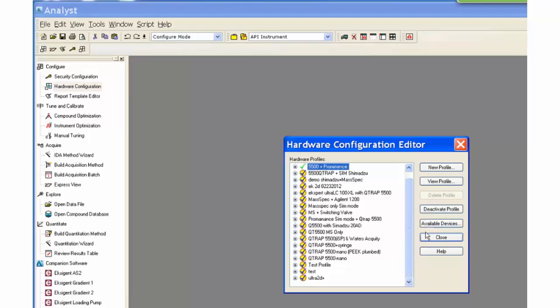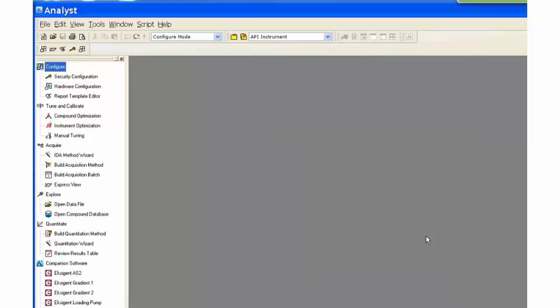Use of different LC systems will be shown demonstrating different ways of incorporating different LC systems into an acquisition method. Assume the appropriate hardware profile is selected for the LC in use.